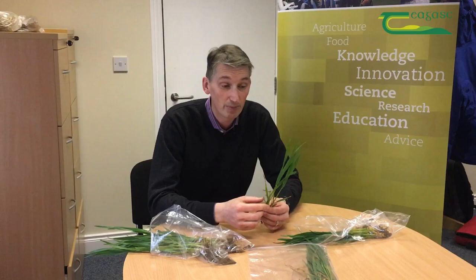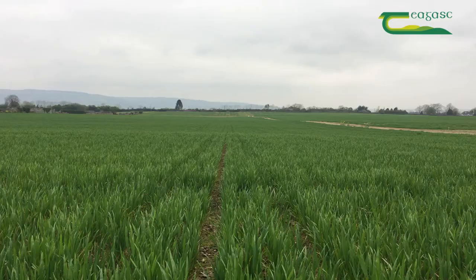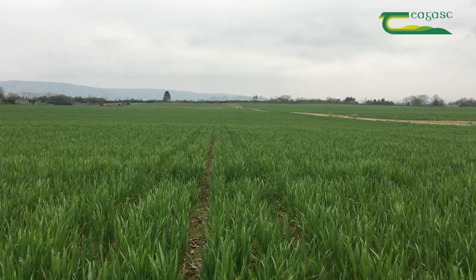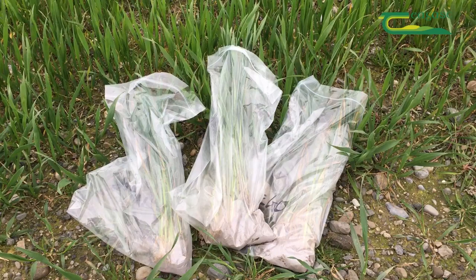What we're going to do today is follow on from the video about the importance of leaf 3 in terms of fungicide control. We're going to actually dissect and unroll some leaves to figure out essentially what the newest leaf coming out is, and that's extremely important.